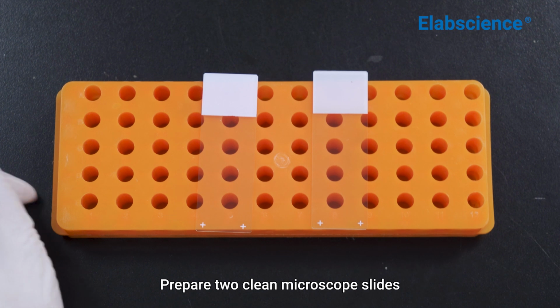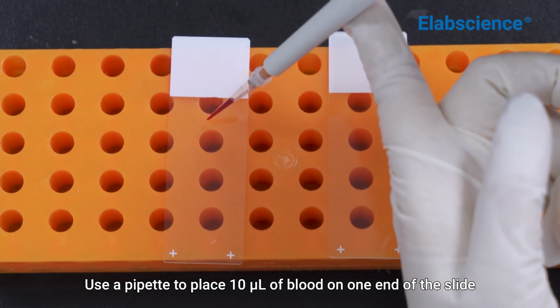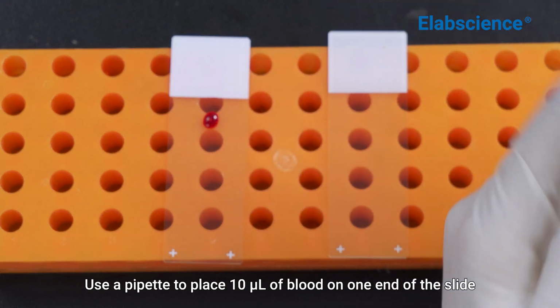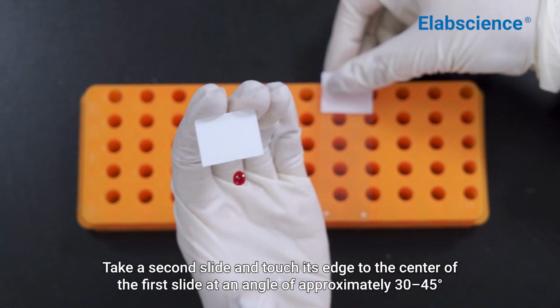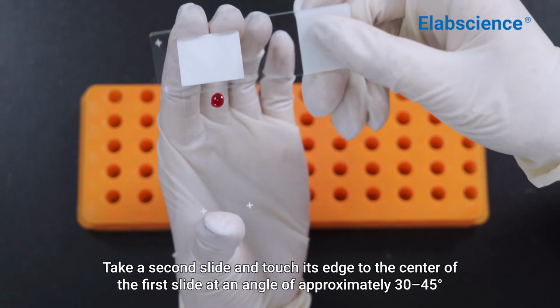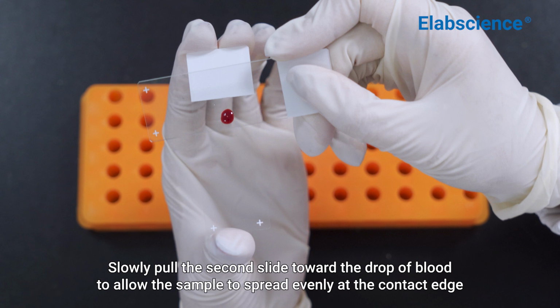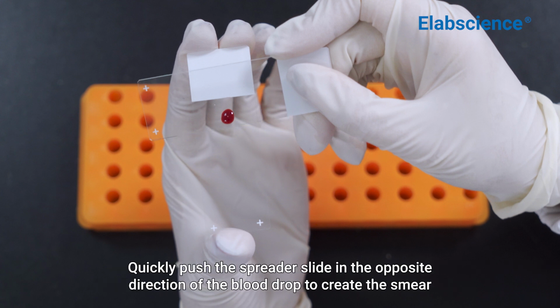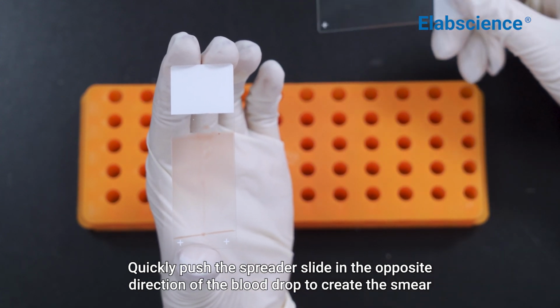Push slide method. Prepare 2 clean microscope slides. Use a pipette to place 10 microliters of blood on one end of a slide. Take another slide and touch its edge to the center of the first slide at an angle of approximately 30-45 degrees. Slowly pull the second slide toward the drop of blood to allow the sample to spread evenly at the contact edge. Quickly push the spreader slide in the opposite direction of the blood drop to create the smear.